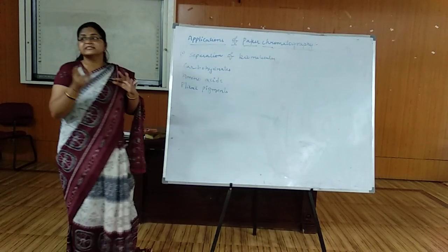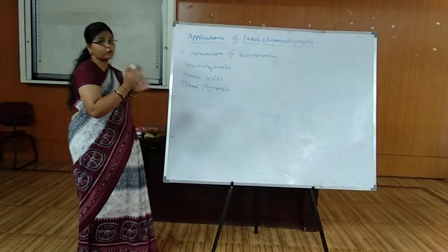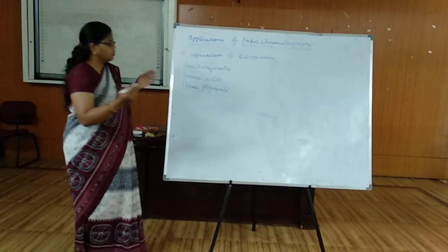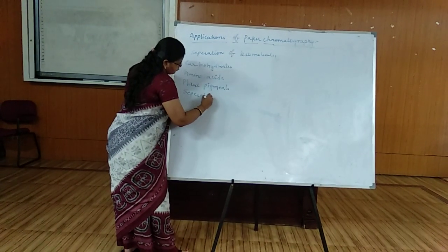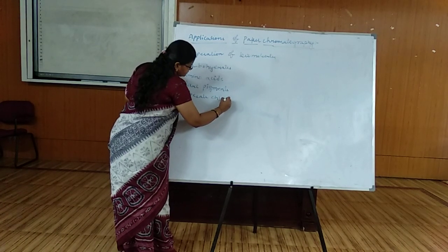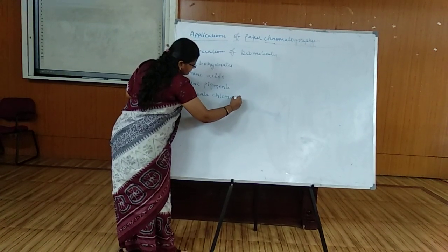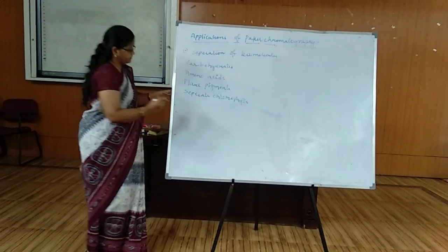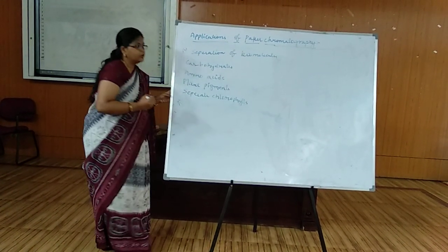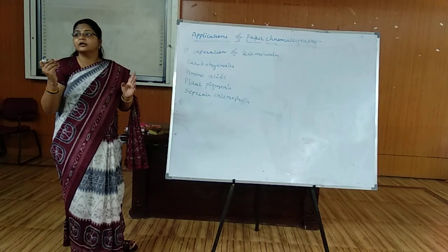then again you can separate different types of chlorophylls. In chlorophylls also you can separate different types of chlorophylls. Then you can check the purity of the sample.